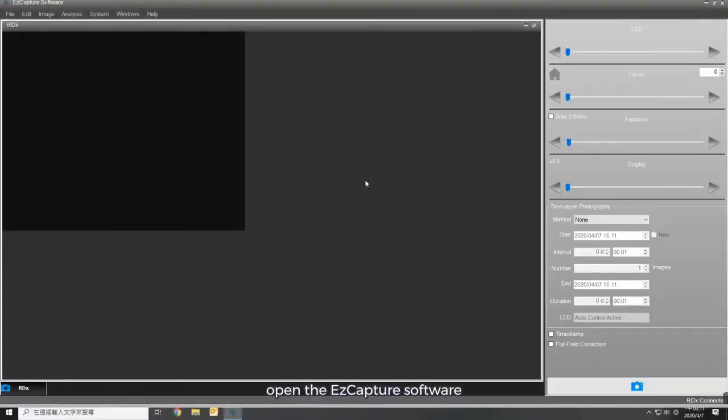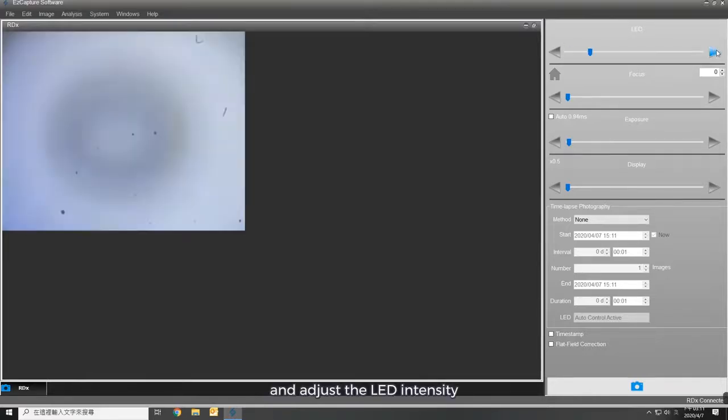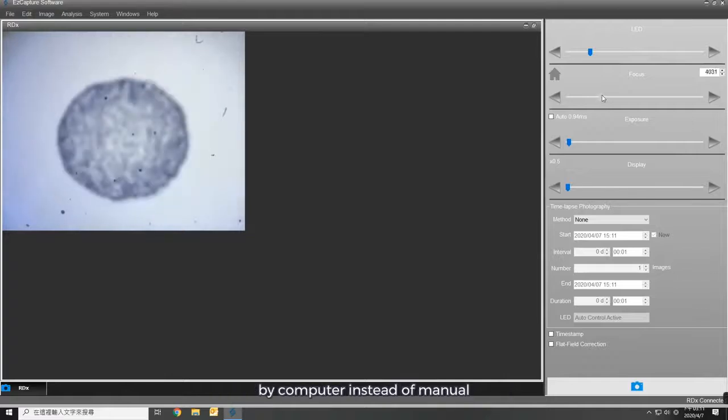Open the EZCapture software, put the sample on the stage, and adjust the LED intensity. Adjust motorized focus, which is controlled by computer, instead of manual.